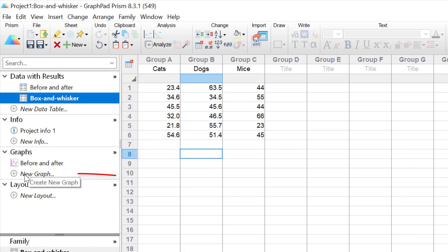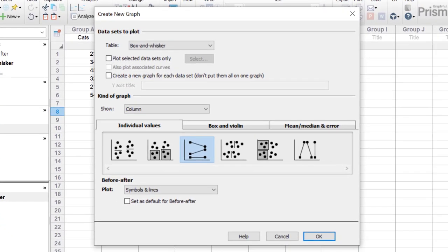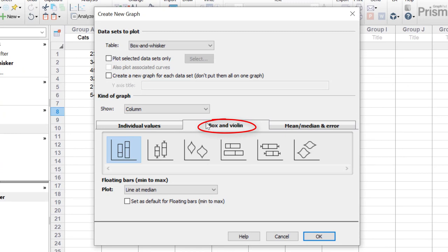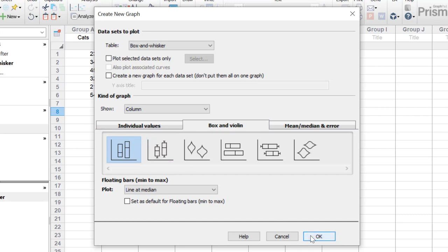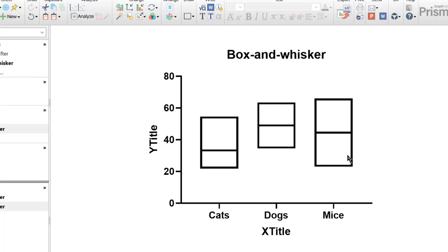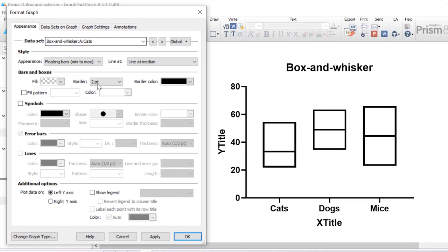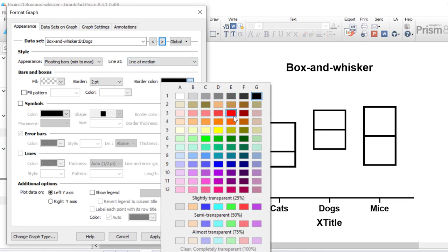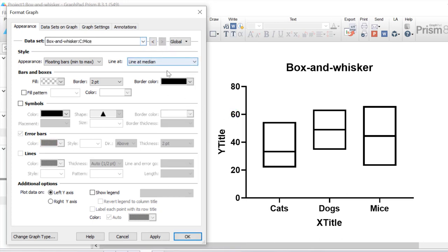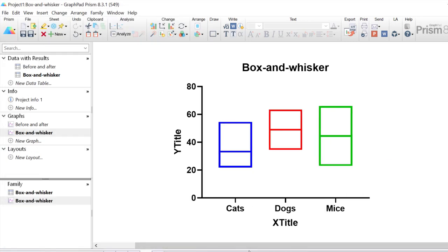With the box and whisker data set selected I'm going to click the new graph button, select the box and violin tab under the column graph family, choose plot the floating bars — the very first option — and click OK. Now I want to make the boxes the same color as the symbols in the before and after plot. I'll go to format graph and change the bars and boxes border color: cats to blue, dogs to red, and mice to green. These colors now match the symbol colors in the before and after plot.